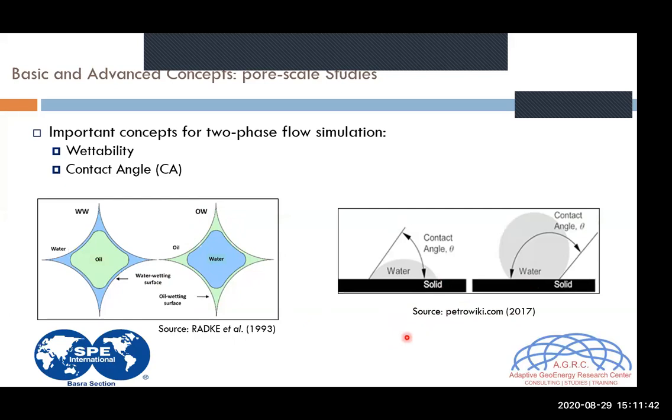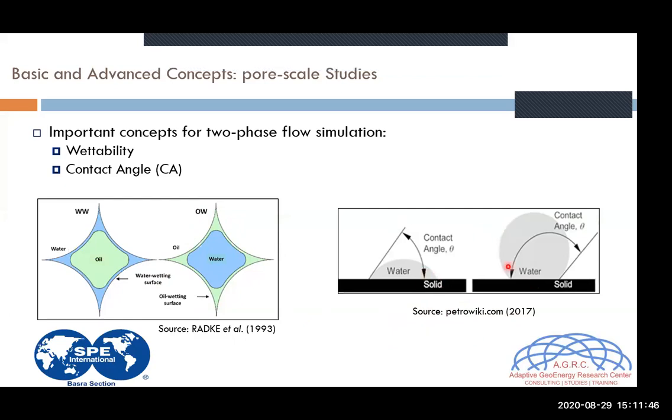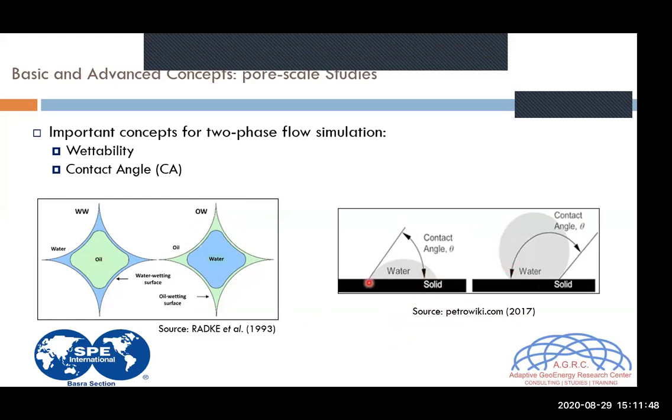And here I will just show you some simple images. In this scenario you have the water spread across the solid face, as you can see. It's a water wet scenario. You can measure this contact angle here, as I can show you with this pointer.